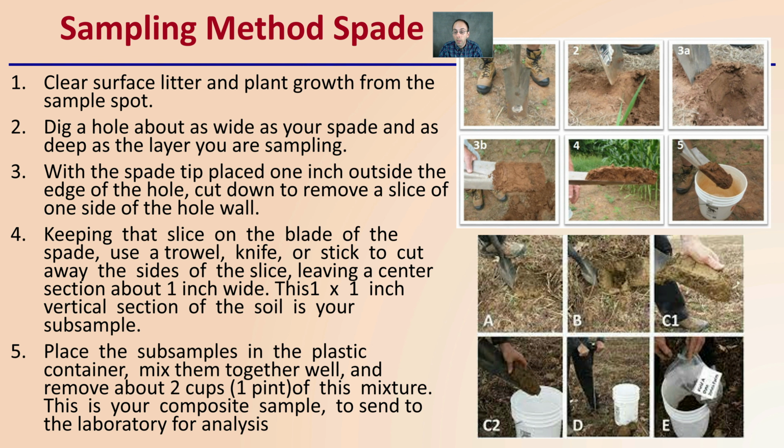I've got a bag over a 5-gallon pail to make sure everything is consistent. I've also got the measuring tape, some bags, and gloves. I can take this out when I get my soil sample and label it. I'm in one field here, and we might be doing multiple fields, so keep in mind that keeping everything labeled is very important, and this is a great way to do that. In addition, the bag keeps any contaminants that might be within the soil in the bucket separate.